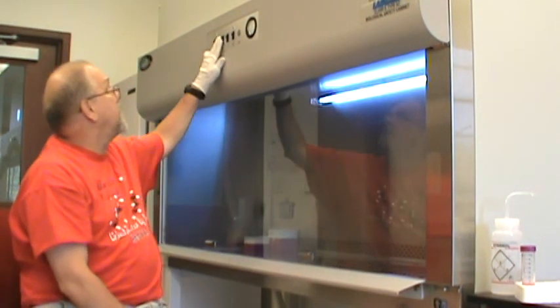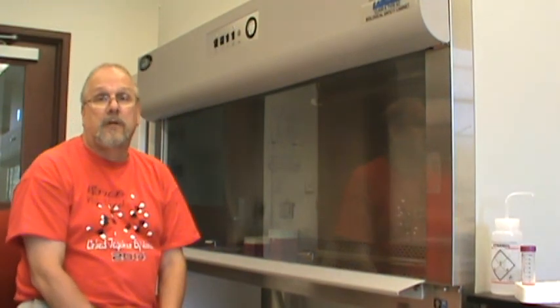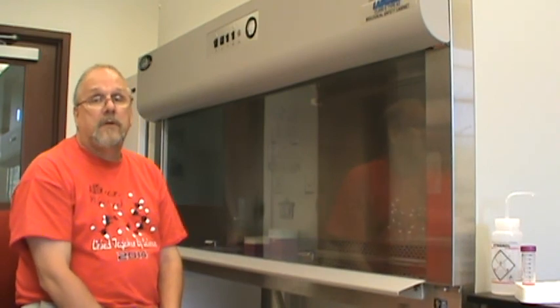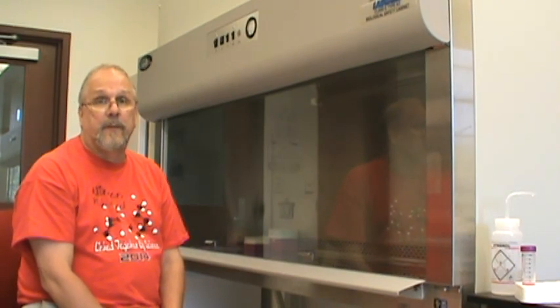Then when you are done, make sure you remember to come back and turn the UV light off. And so that is how we use this laminar flow hood, and we will use it in our cell tissue culture experiments.